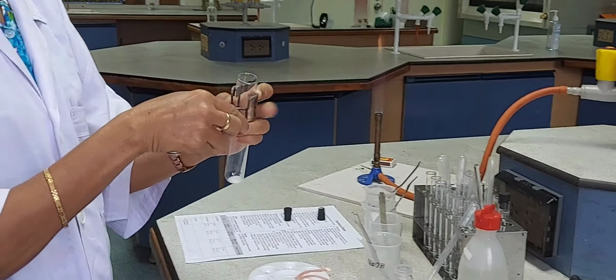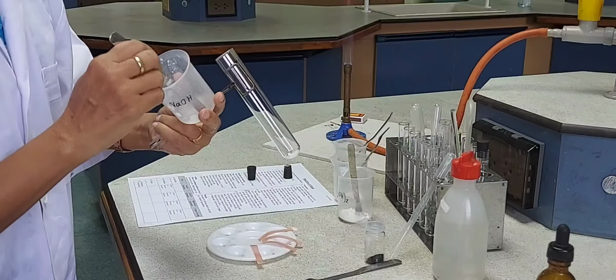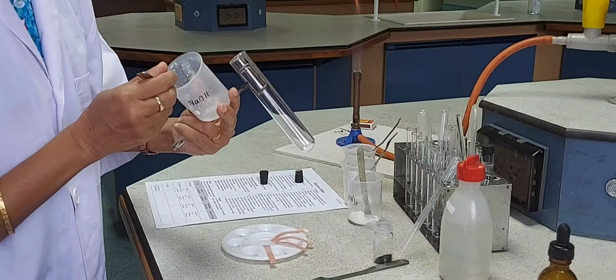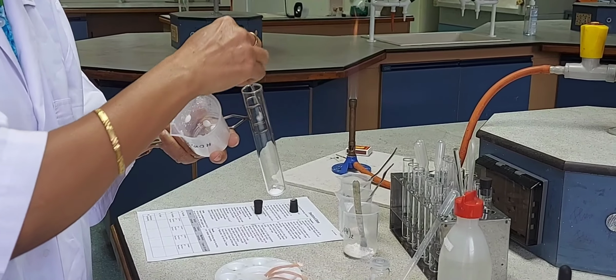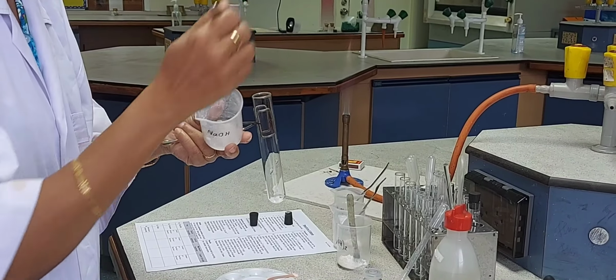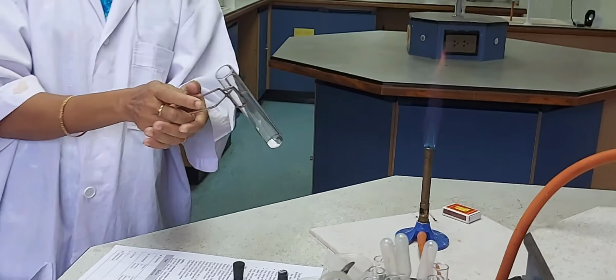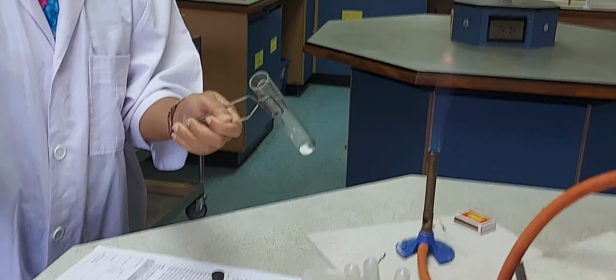So ammonium chloride is taken in the boiling tube, and to this I am going to add a few pellets of the sodium hydroxide. And then I am going to heat the mixture and observe what happens.